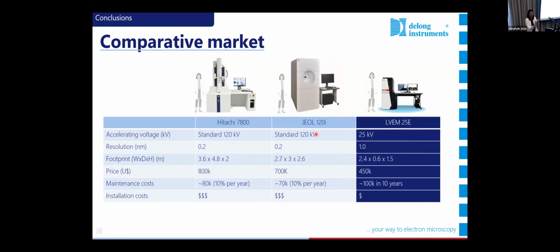We actually have collaborations with Xing, and she mentioned it to us already. I never calculated it, but if you are not using the microscope, it's off. You turn the electron source on and off all the time, because it takes about 1 minute to warm up, differently than the standard or conventional system, which usually you keep on. Overall, it's less, of course.